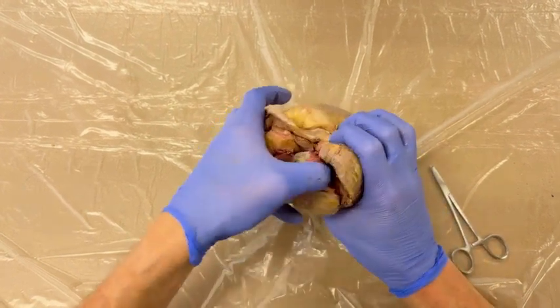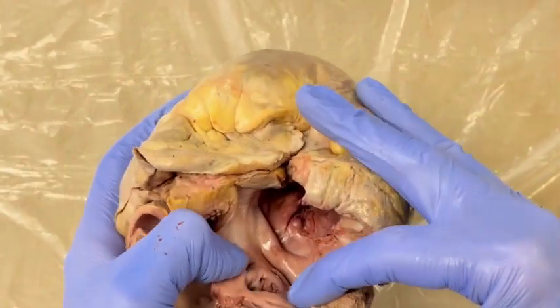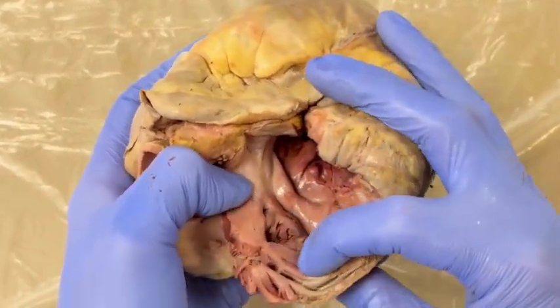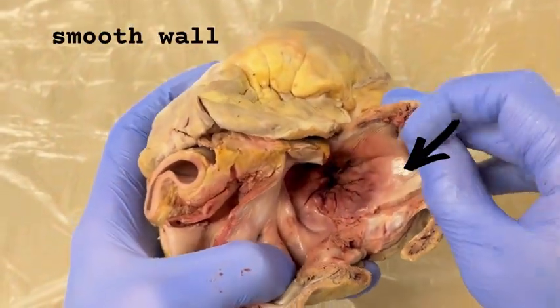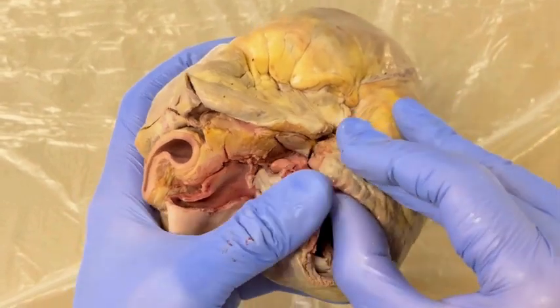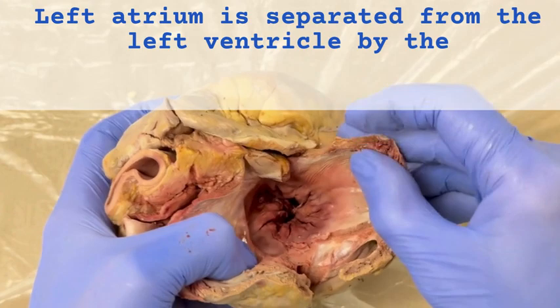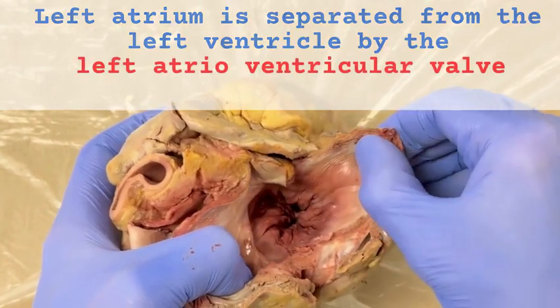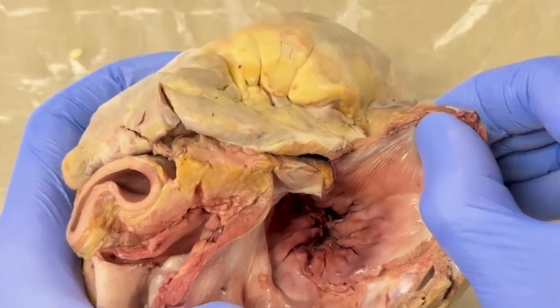So we've opened up the left atrium that you can see here, and there is both a muscular portion with pectinate muscles and then a smooth wall portion that are fused together to form the left atrium. And the left atrium is separated from the left ventricle by this valve called the left atrioventricular valve or mitral valve.